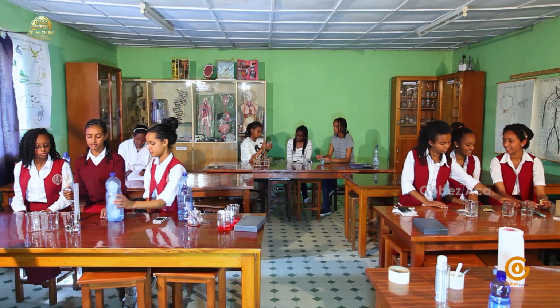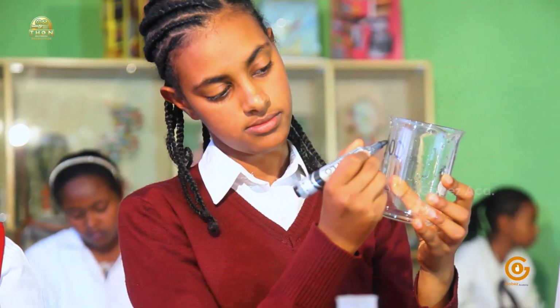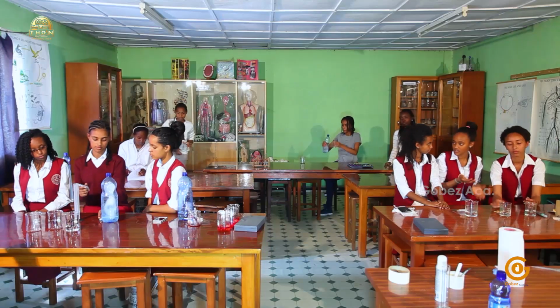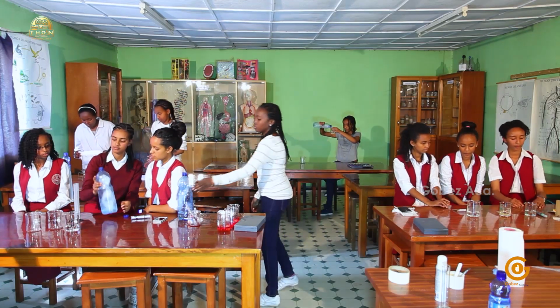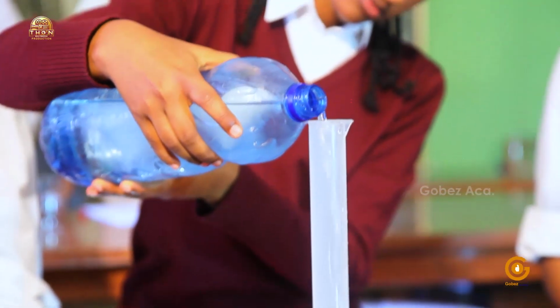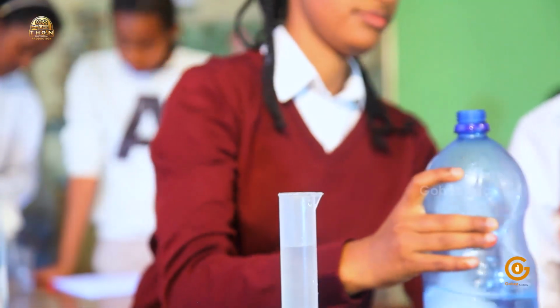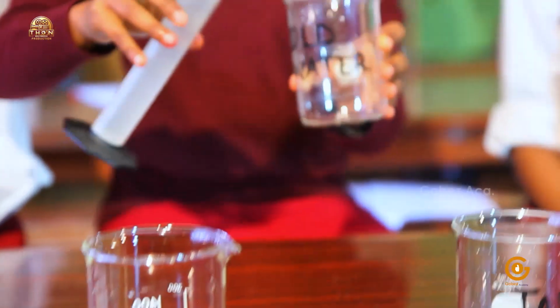On the second beaker, I write cold water on it. And put into it water from the fridge.